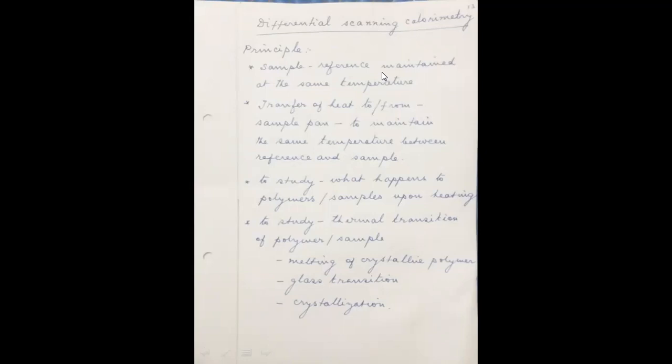The main application of this differential scanning calorimetry is that you can study the actual happening in the polymers and in other samples while heating. What is happening when the temperature is raised in the polymers? What happens in the other samples? That mechanism can be followed by this differential scanning calorimetry.